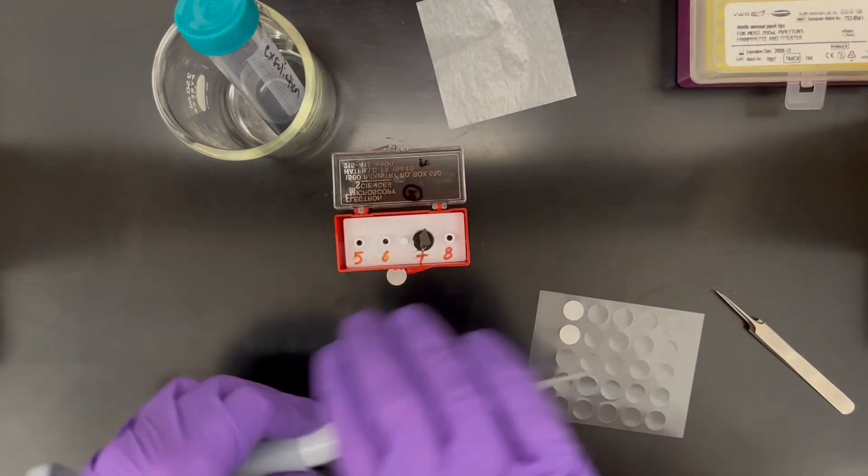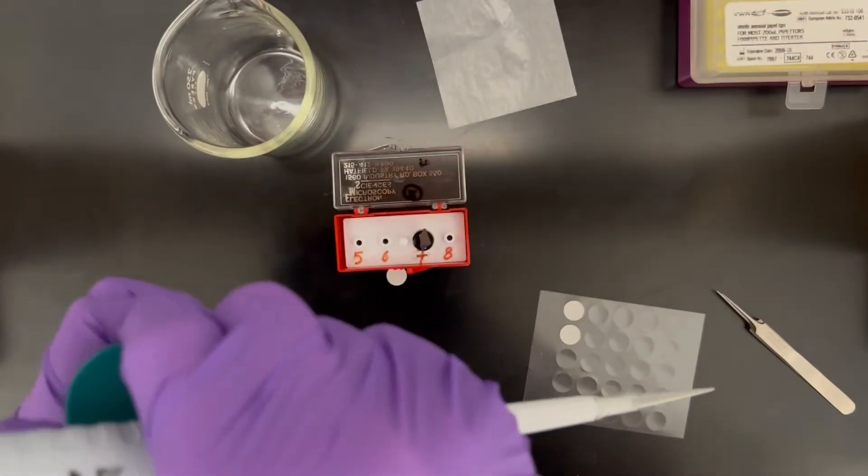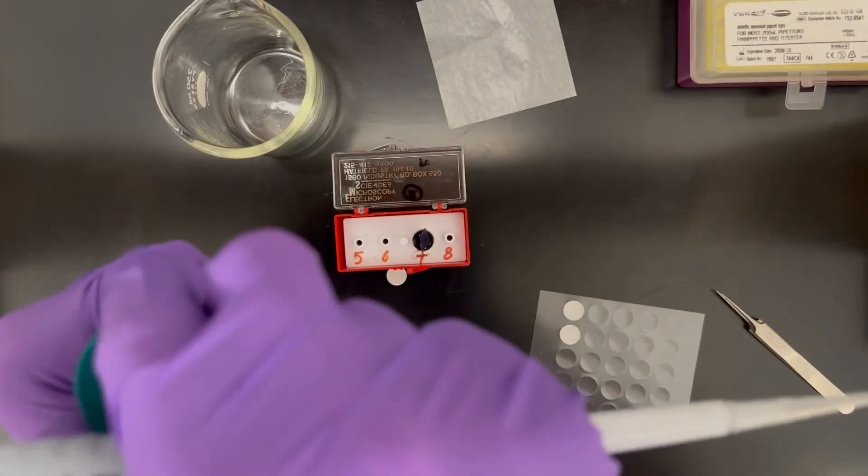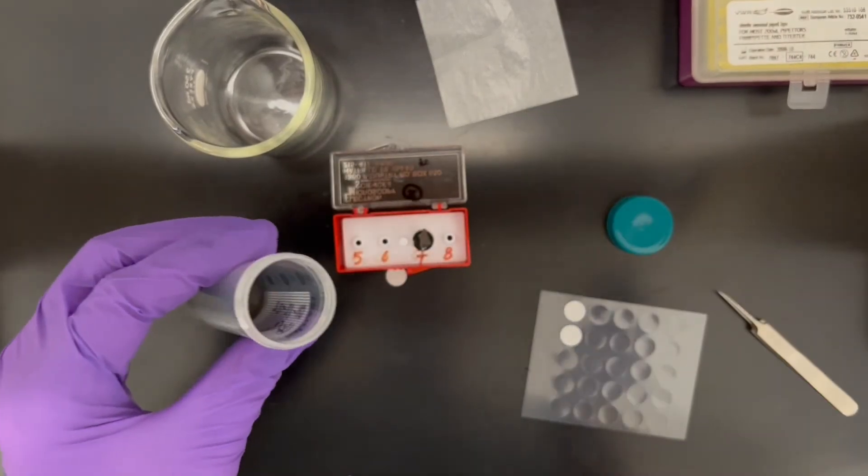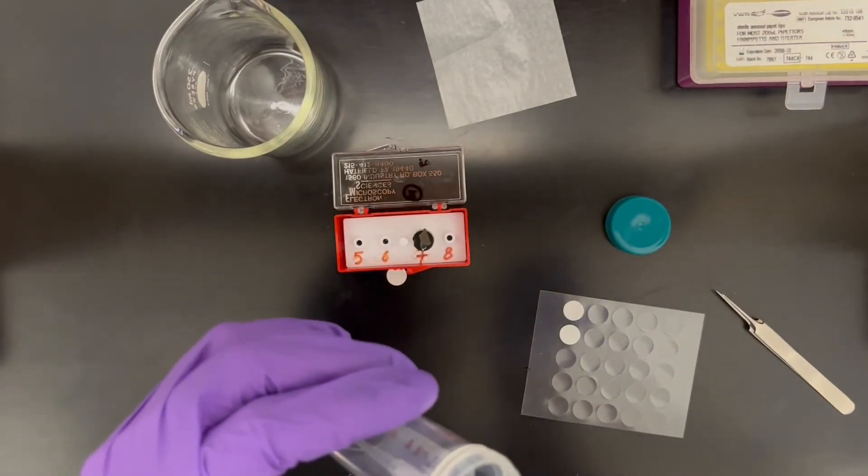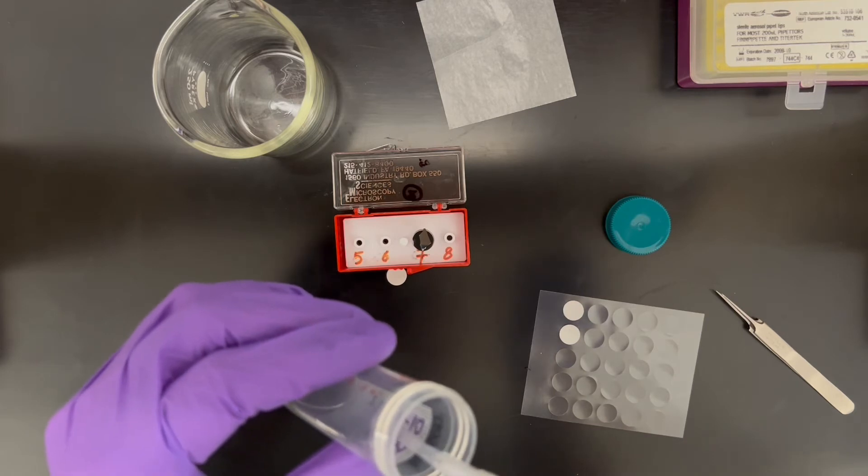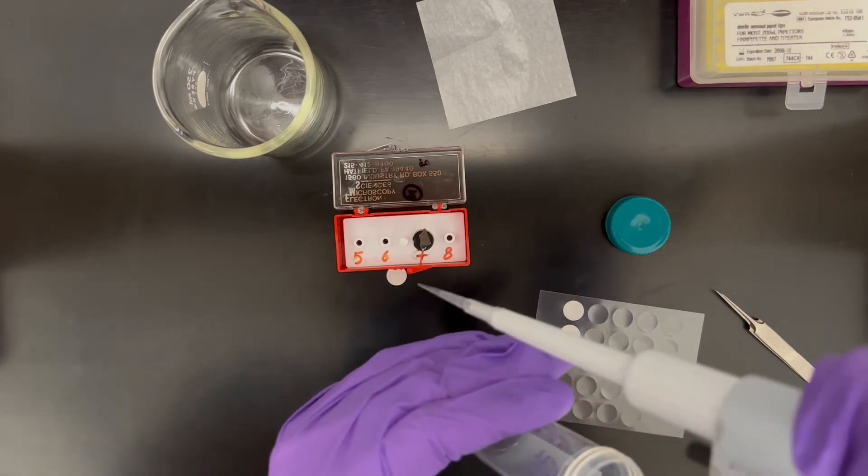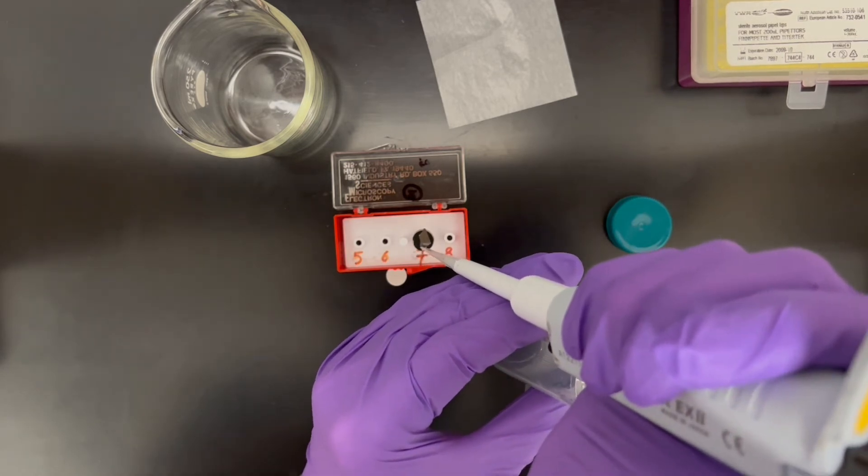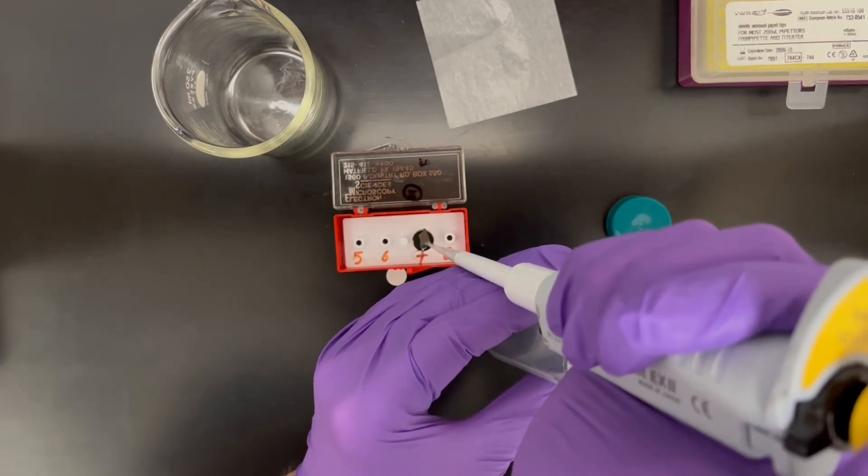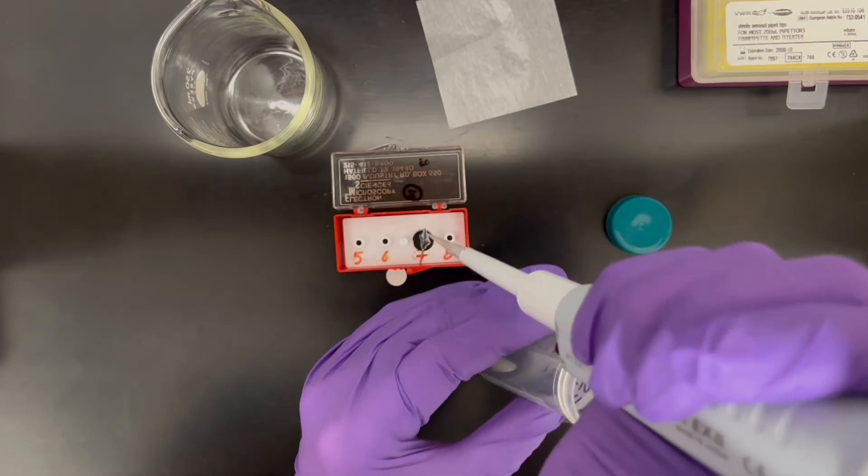Get your pipette, take your sample, and then pipetting from about the middle of whatever your liquid is, put it straight onto the silicon.